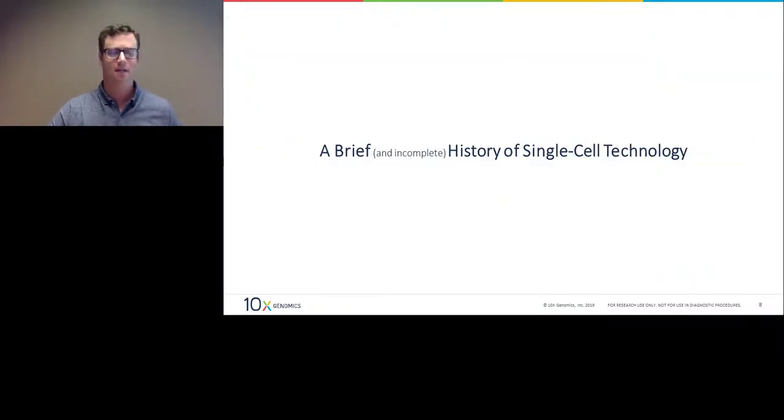So first, I'd like to give a brief history of single-cell technology. So single-cell technology did not start off with 10x Genomics or Drop-seq or any of the single-cell technologies you may know and love today.